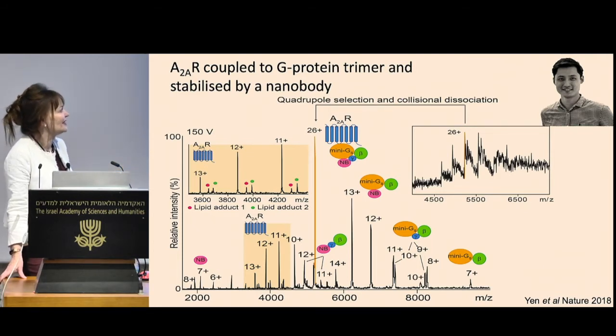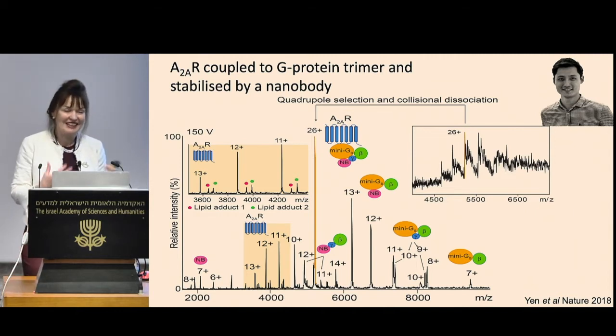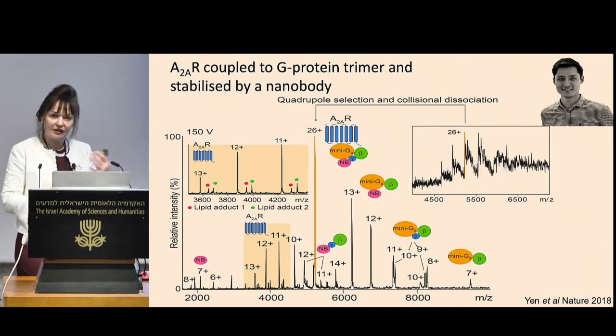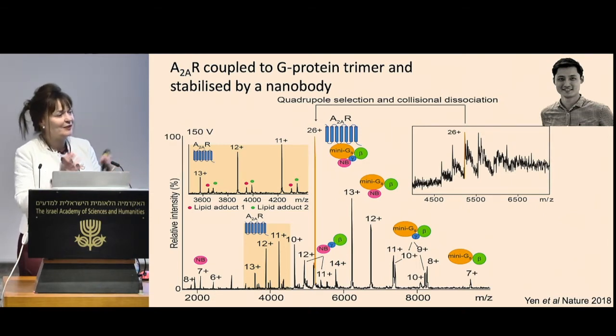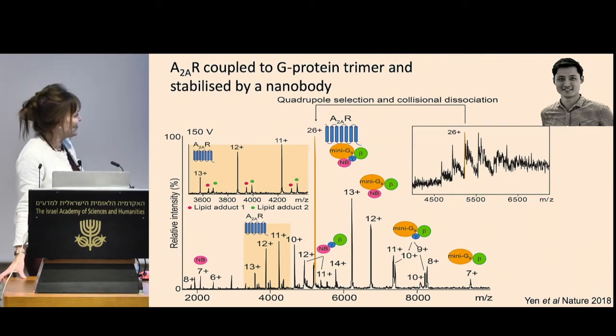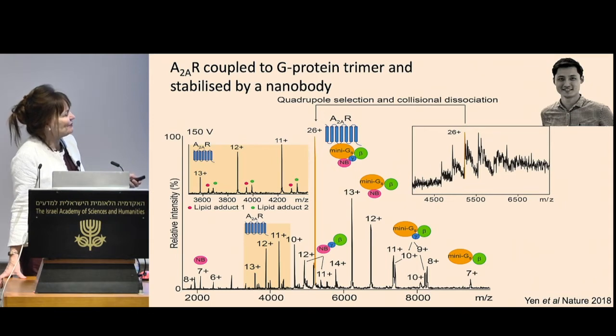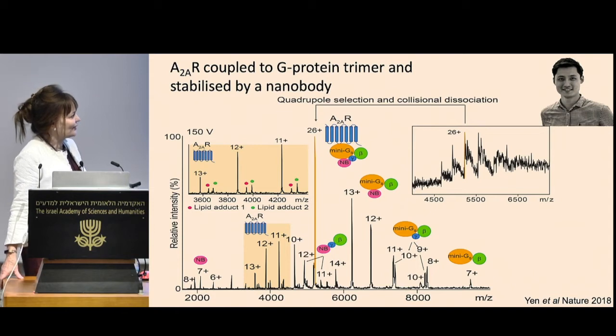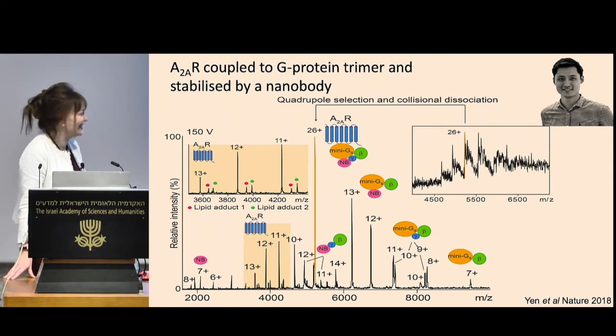And he worked, I would say, day and night to get this to work, very dedicated, explored all sorts of different detergent combinations, detergents and lipids, our homemade detergents, all sorts of things came into play. And he managed to get this spectrum. And I remember he sent me an email saying, I've got it, it's amazing. And then I saw it and I was really disappointed because it doesn't look so great.